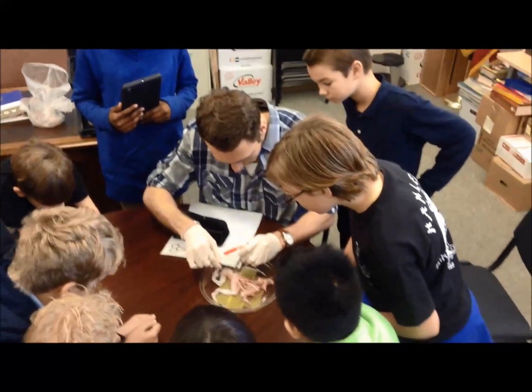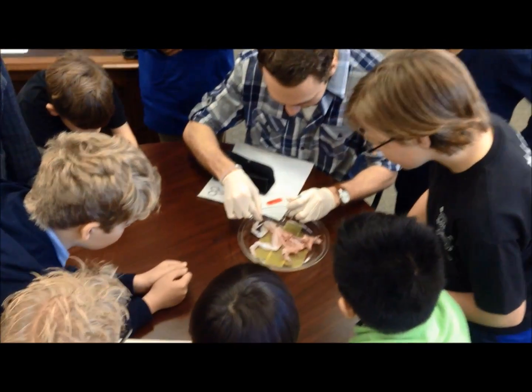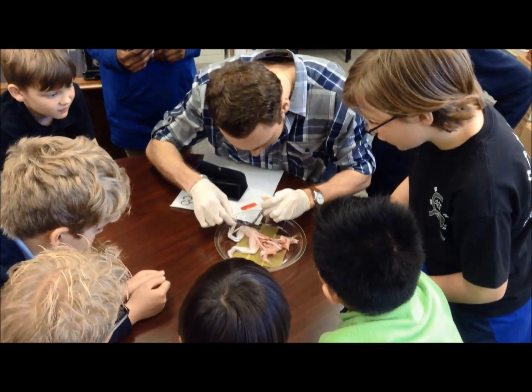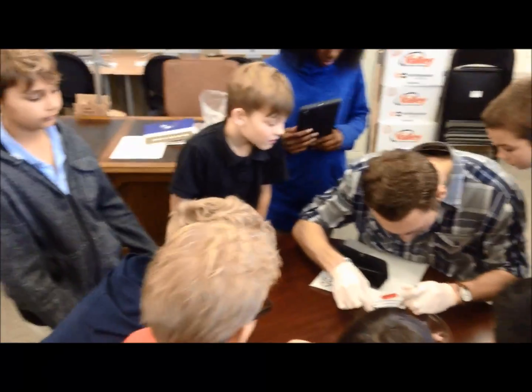Did you see that? It's somewhere around there. You're touching it right there. Is that it? That little white path? See it moving? Oh my gosh, the entire thing is moving!